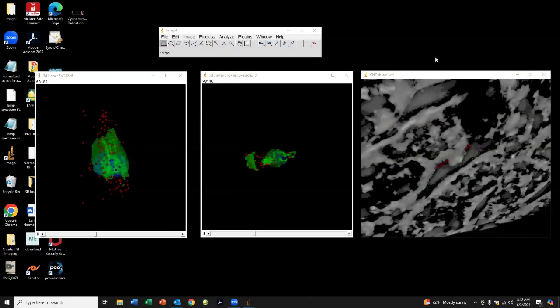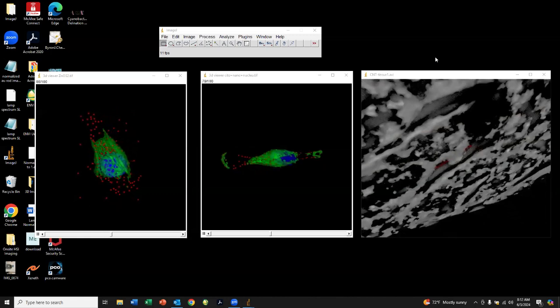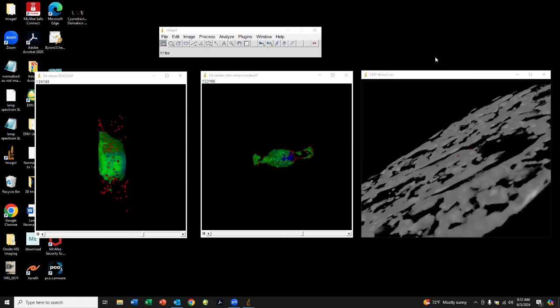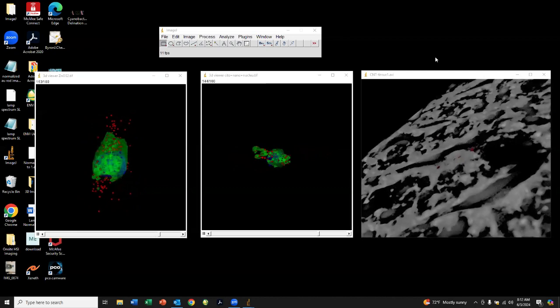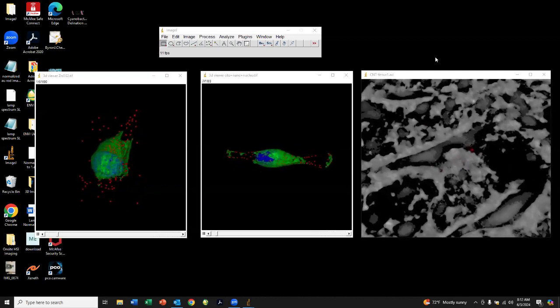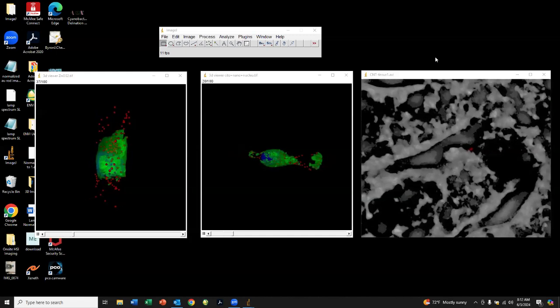Hello, I'm Byron Cheatham with CytoViva, and today we wanted to just show you really quickly how 3D imaging of nanoparticles or nanomaterials in cells and tissue works with the CytoViva 3D microscopy system.